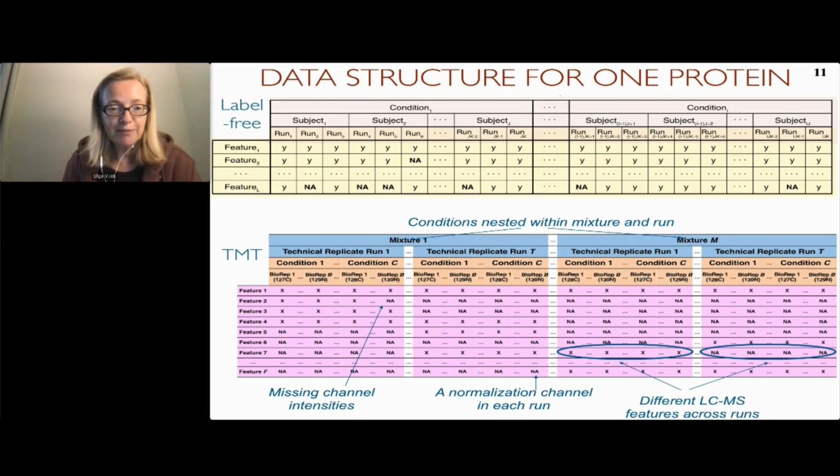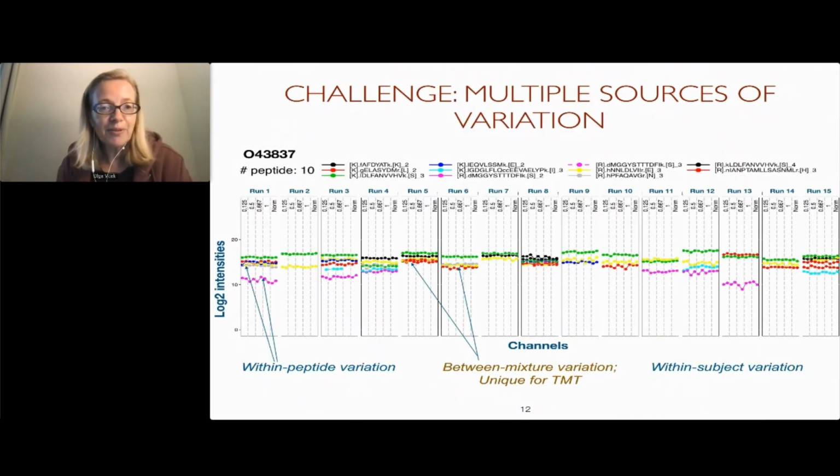So to be more specific, this is one example. This is a controlled mixture. This is how MSstats typically visualizes that. I see that the quality of the image doesn't come out really well, but let's try anyway. So here, each panel is a mass spectrometry run, and the dashed lines in each panel separate the conditions. The conditions are annotated with the abundance of a particular protein.